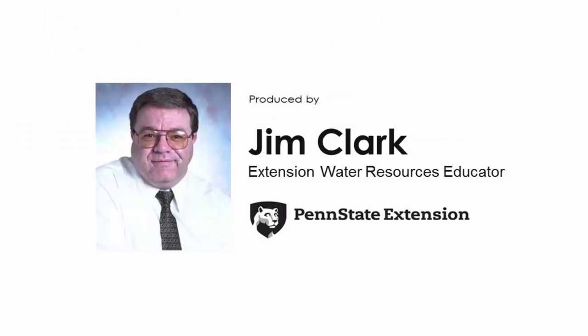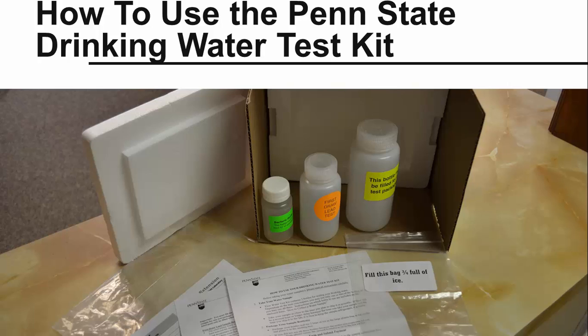Hi, I'm Jim Clark and I'm here today to talk to you about using the Penn State Drinking Water Test Kit to successfully analyze the quality of your drinking water. Over 6,500 drinking water samples have been submitted to the Penn State Water Lab for analysis since it opened in 2007. Water test kits are available from the lab itself or your local Penn State Extension office. This presentation will walk you through how to use the kit to submit the best water sample possible so you can get the most accurate analysis done on your drinking water.